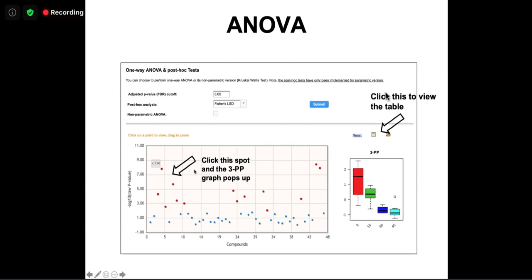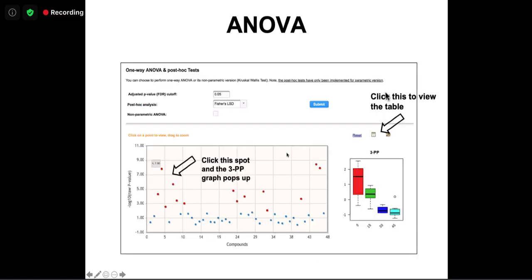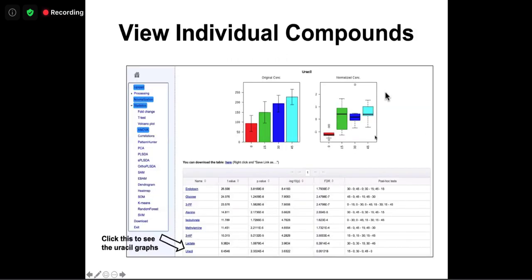Here you can see the result is interactive graphics. Significant features are red and non-significant ones blue, and you can click to see the figures. We have enhanced these figures, so they will look slightly different, but better. How do you get the details? You can see there's a table icon; you click it and you will get the details. If you click details, you will see another table.